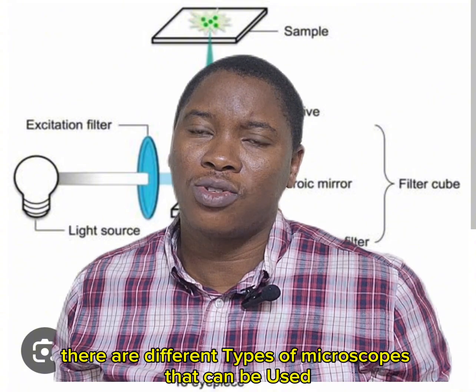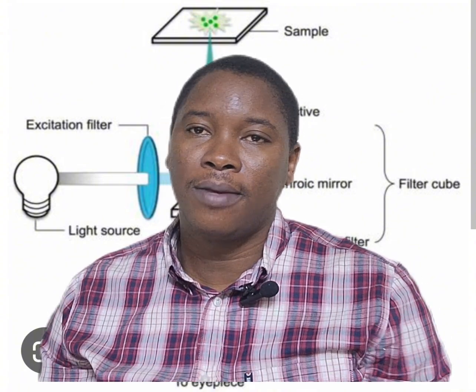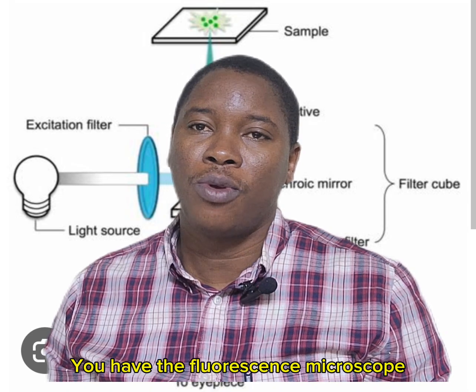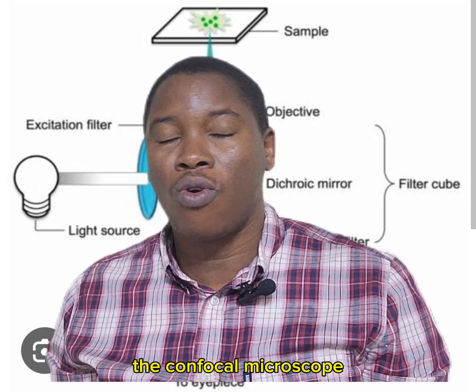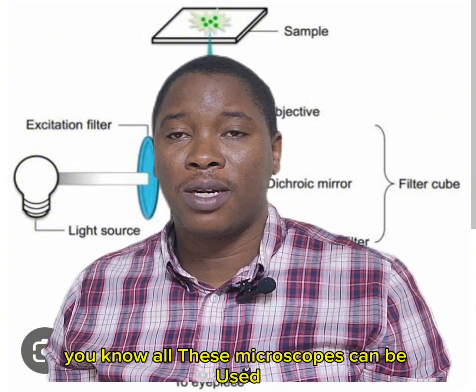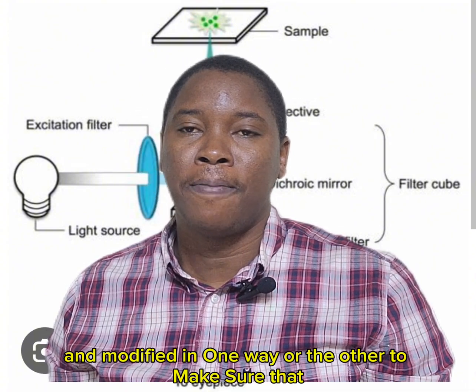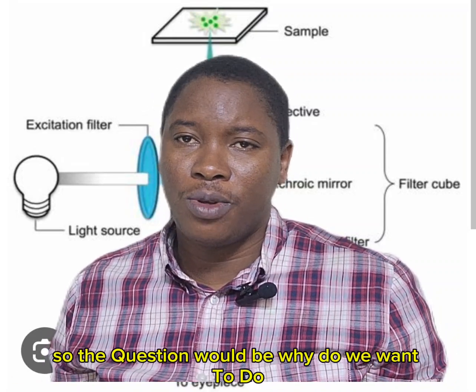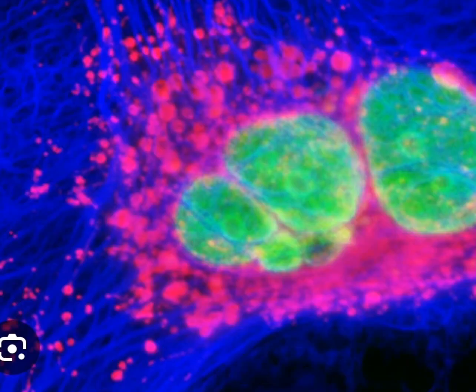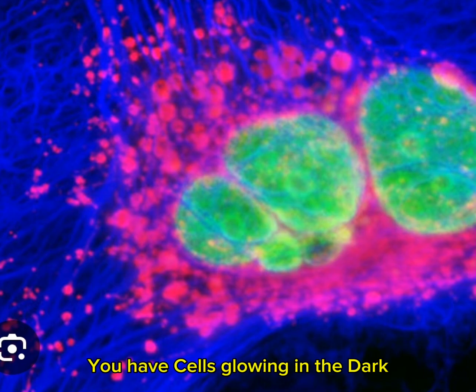There are different types of microscopes that can be used for this technique. You have the fluorescence microscope, the scanning focus microscope, and the confocal microscope. All these microscopes can be used and modified in one way or the other so that you can use them to do fluorescence microscopy. So the question is, why do we want to do fluorescence microscopy? Why do we want to have a situation where cells are glowing in the dark?